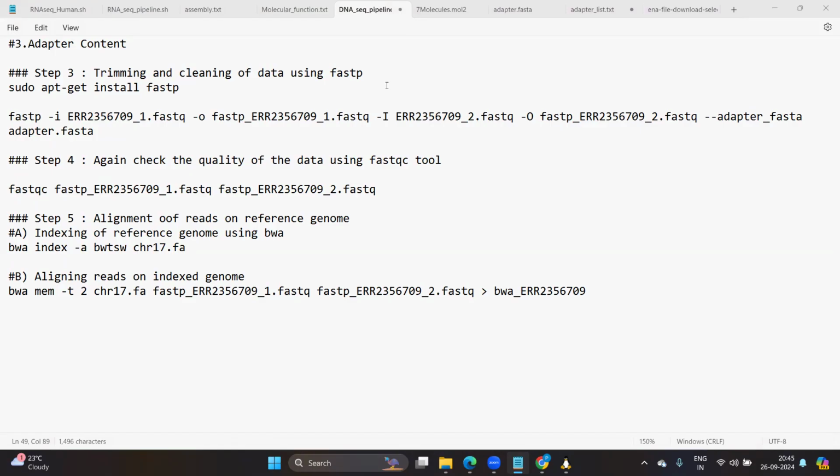Only 1, because in the forward and reverse files you have the same data, sequenced from both directions. Even though you align your data from the forward or reverse, it will align at the same location. So that's why we will generate only 1 file over here. So let's provide only 1 file name.